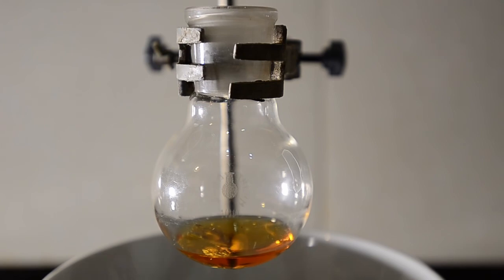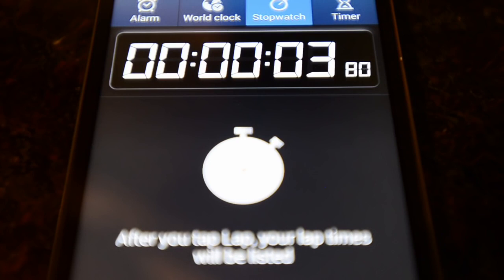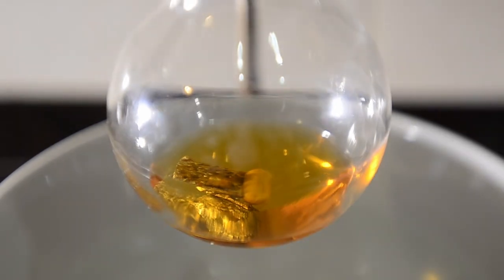We've got a cold water bath set up just in case we need it. At this point we started the stopwatch. We waited a couple of minutes but there was no sign of a reaction, so we added all of the methyl iodide solution to the flask and continued to wait.